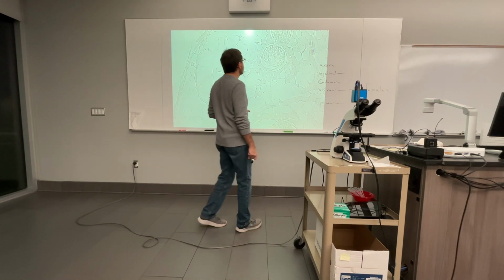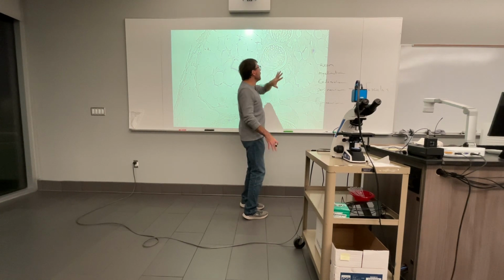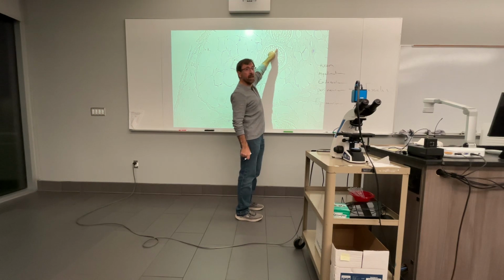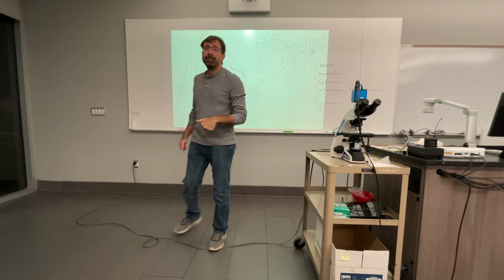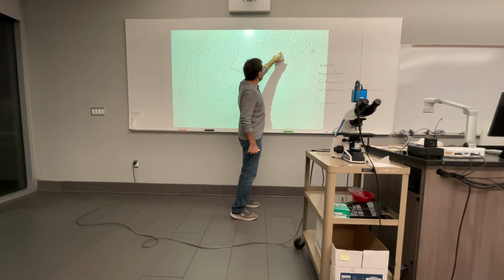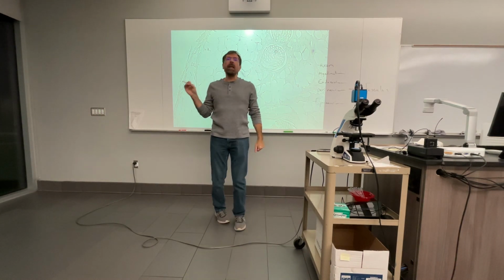Okay? And then when I look at it the way I have it focused, and you can change which thing is darker and which one's lighter, and that's fine, whatever. But the way that I have it set up, then you see the white space there, we're going to consider that to be the myelination. Okay, myelination is what makes white matter white. And then all of the purpley that you see around it, each one of these has that surrounding it. That's going to be the endoneurium.